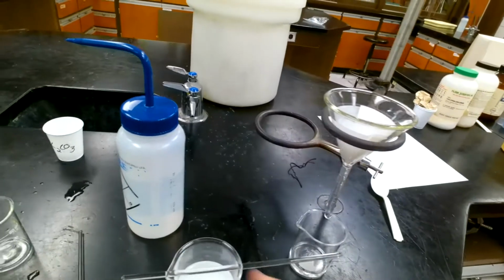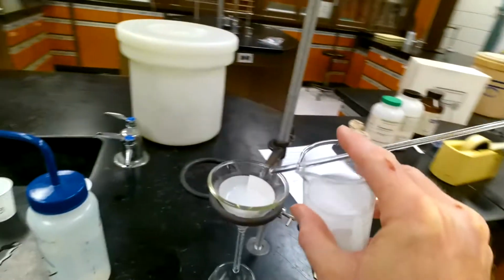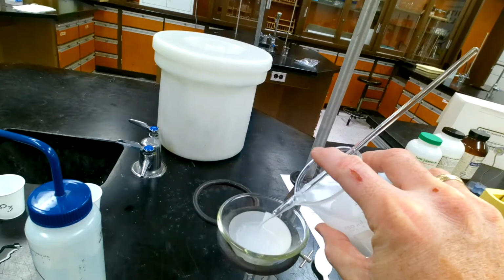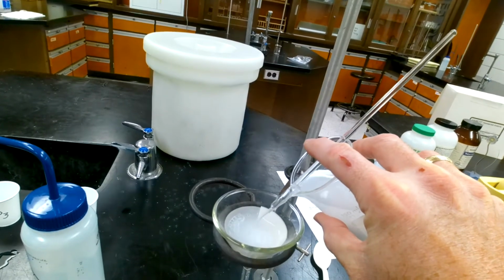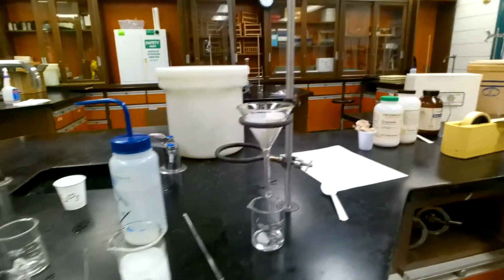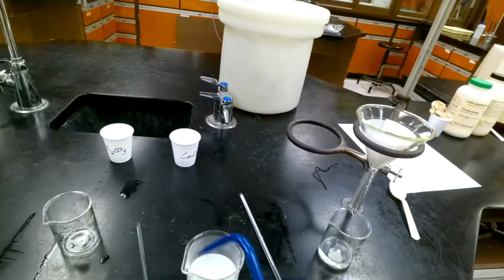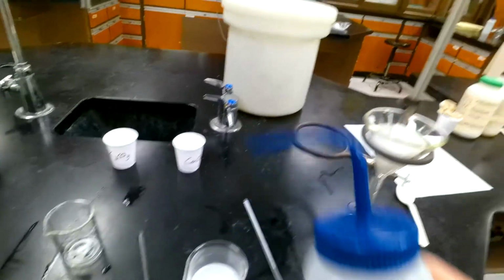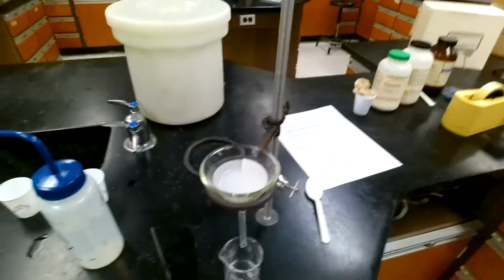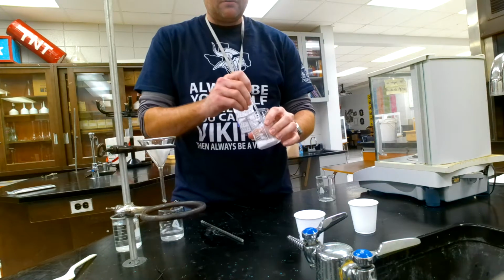You take your stir rod and put it over the lip of the beaker right here, and then you pour, and that way the solution goes right down the rod. Okay, that's what we're looking for. Now another thing we're looking for is when we have to rinse this. At the end, whenever we're done, we'll try to rinse it, and we'll still pour that rinse down the filter paper, because again, we don't really care about the water, we just care about the solid. Okay, so we're almost done with this.